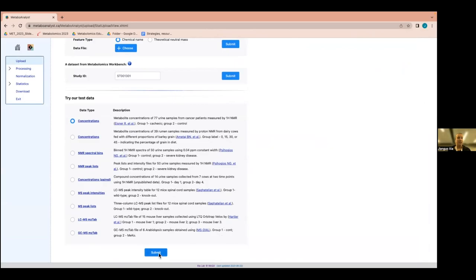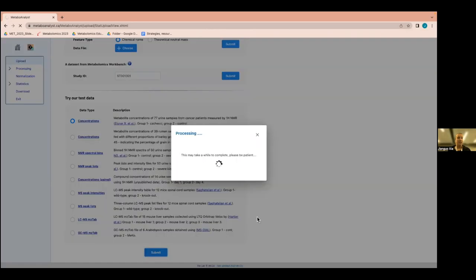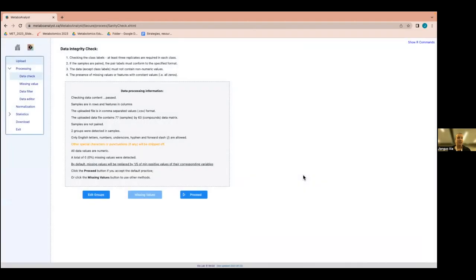I'll leave the first option selected and click Submit. MetaboAnalyst already has about a hundred people using it outside our workshop right now, so things might be a little slower. If there were missing values in the data, you could click a button and choose from different imputation methods. This dataset doesn't have any missing values, so we'll just click Proceed.